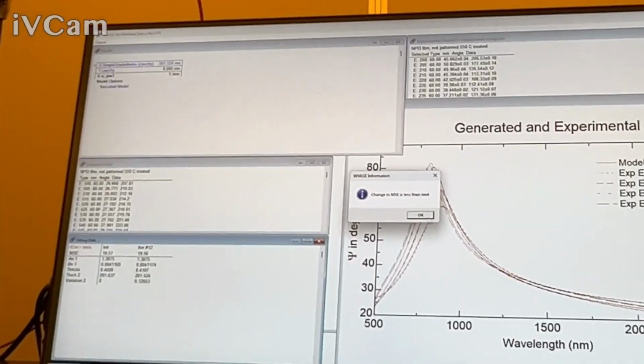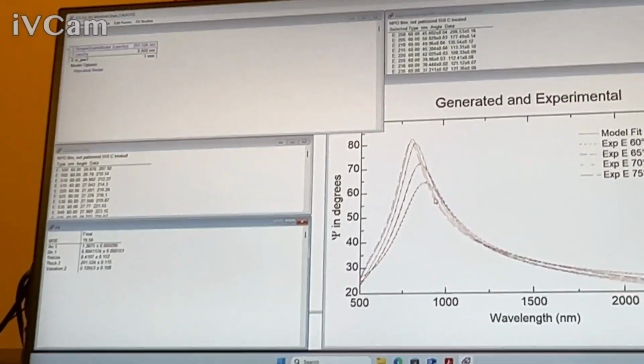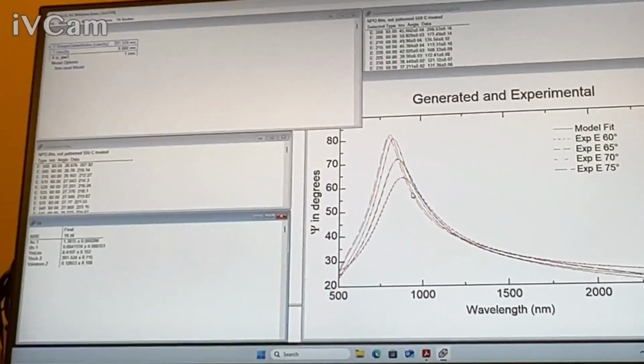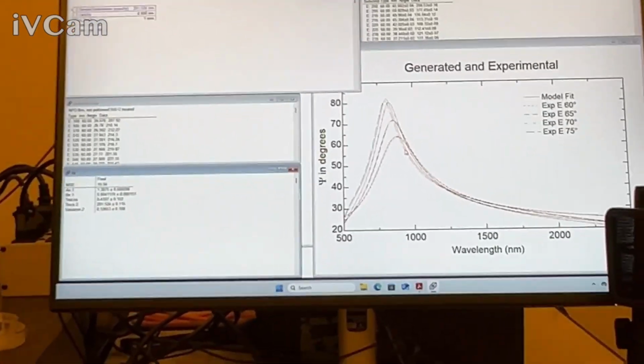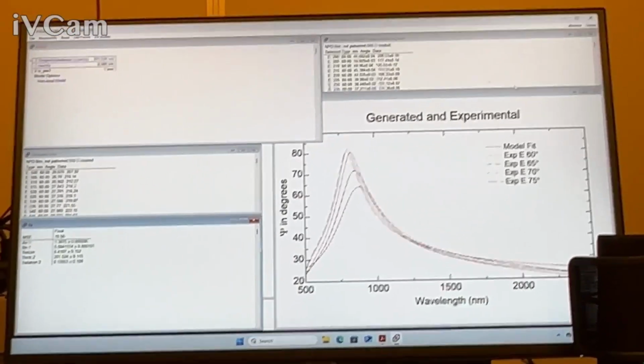So in general, I think it might be a little bit higher index, but like you said, that might be because it's just not. Hey, how are you doing? That makes sense. I mean, similar. You've done that. That's what you do. This is the same stuff you've done before. But we didn't need that higher resolution last night, but I didn't know. So we did a really long measurement.